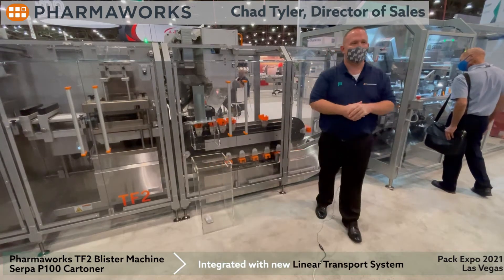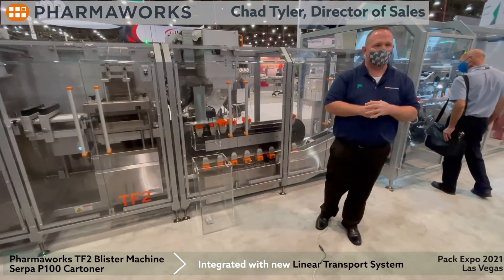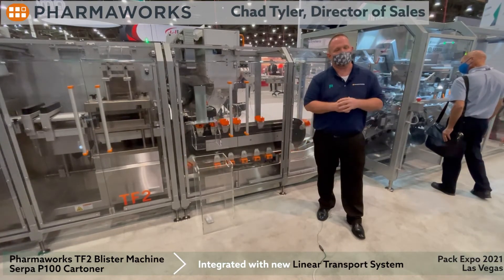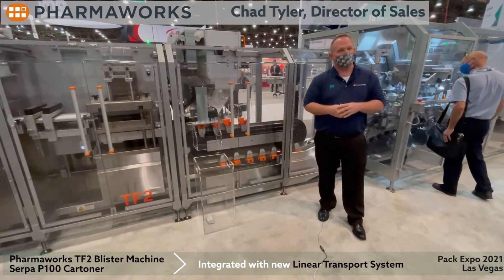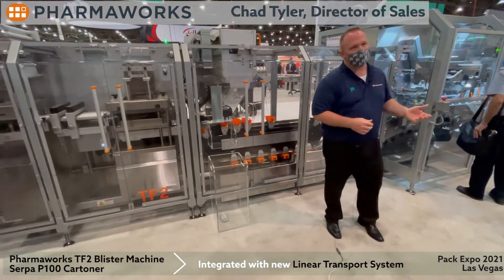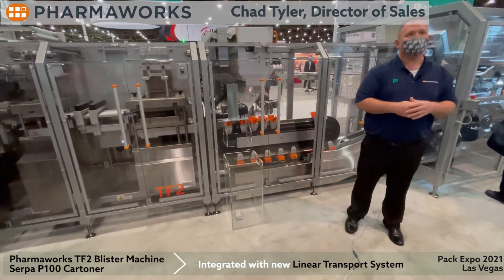Hello everyone, my name is Chad Tyler. I'm the director of sales at PharmaWorks, a ProMoc product brand. I'm here today to introduce our TF2 with a really nice integration to a P100 Serpa Kartner. Serpa is also a ProMoc product brand.